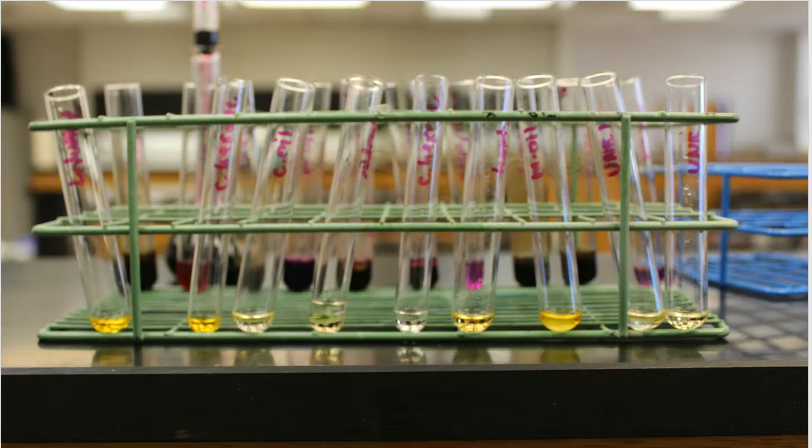All right, so here is the lineup of the alkenes or possible alkenes with our bromine test. That's really what we're after. So this is a still image, so that way you can make your observations. You can pause this video at this point, kind of take a look at what's going on. Some of these testing positive, some of these are testing negative. So it's up to you to really figure out which one is which.